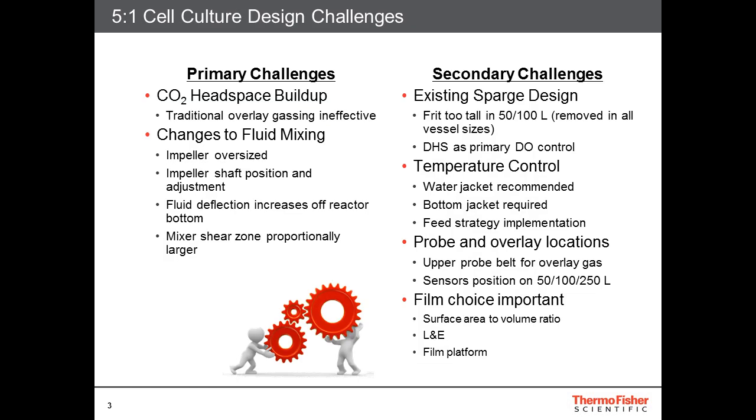When we operate the bioreactors at 5-to-1 or 20% volume, one of the primary challenges is carbon dioxide buildup in the headspace due to metabolic activities.